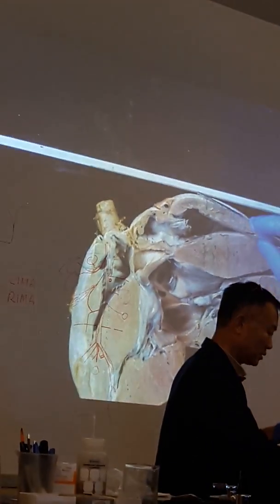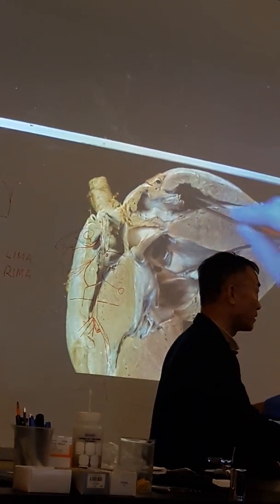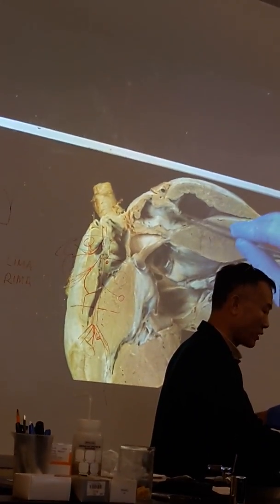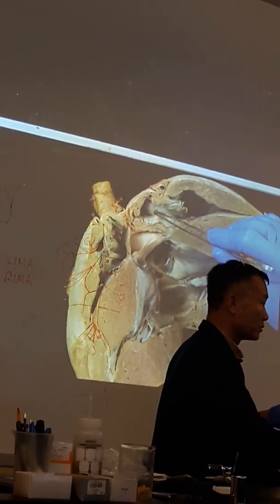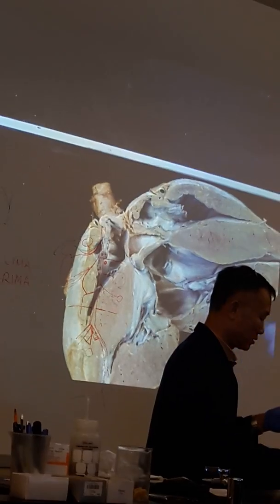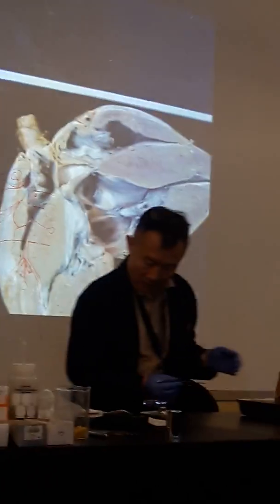Okay. The thin side, this must be the right ventricle. Above the cuspid, this is tricuspid, right? So this is the right atrium. Okay? So for this, left atrium, left ventricle.